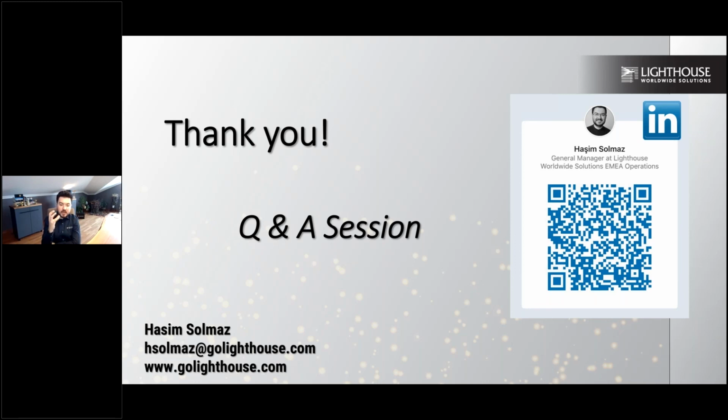Have these, because you don't know if this LAF unit can provide this zero count all the time. Maybe there is a glitch on your LAF structure, or the biosafety cabinet has turbulence in it. We don't know. We don't want to add another parameter on top of our expectation. That's why having the original isokinetic HEPA filter on top of your particle counter is the best approach.